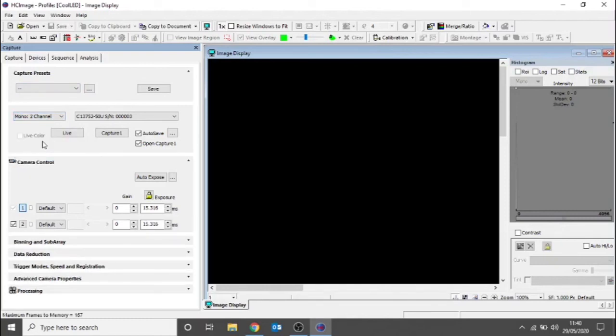And from here, we can use our settings from previously, so the 365 and the 490 nanometer modes we set up. These can be selected below in the drop-down tabs. Firstly, choose the 365 nanometer, and below the 490. This will refer back to the settings we just created. Here you can also adjust the exposure, and there's also the option to auto-expose as well. Although in this demo, as the camera is not connected to a microscope and still has a lens cap on, this wouldn't be required. If wanted, a live image can also be viewed by clicking Live.